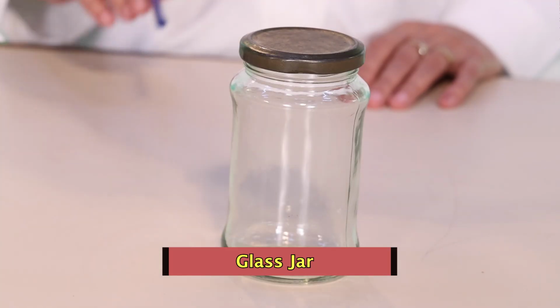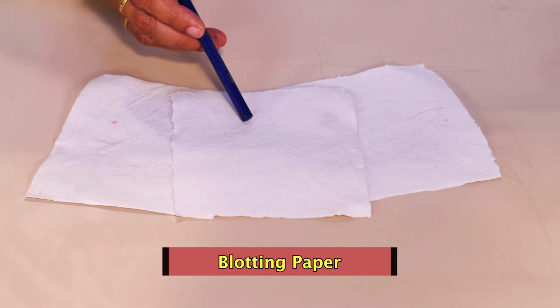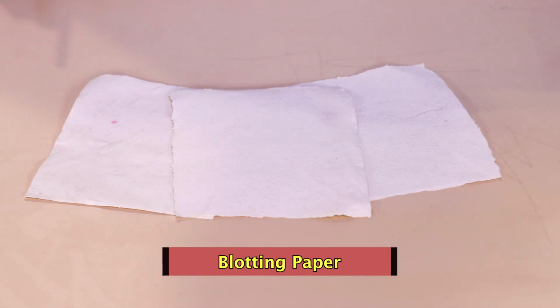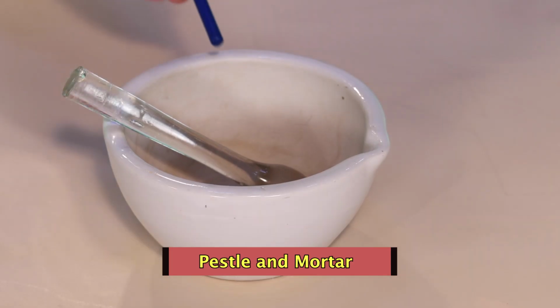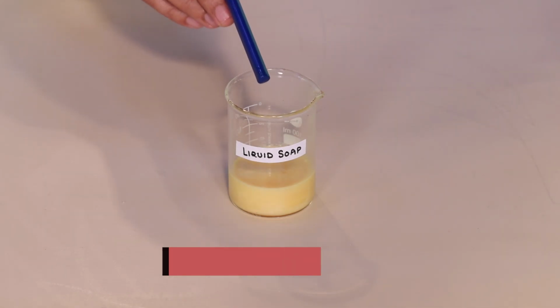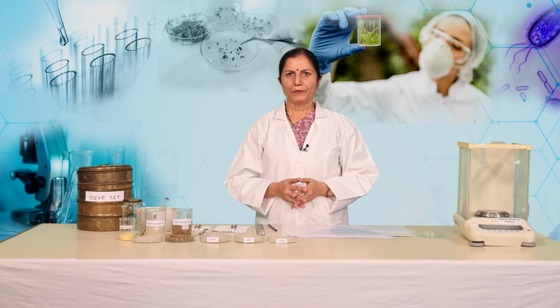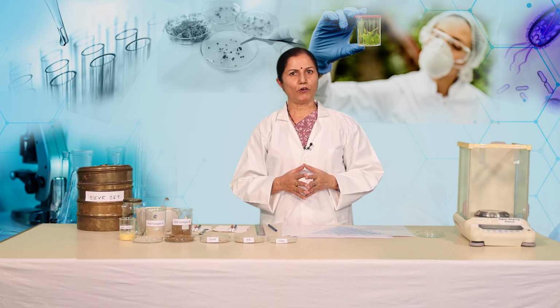To perform this experiment, we require an oven, dried soil samples, balance, mechanical sieve set, glass jar or wide mouth bottle, scale, blotting paper or newspaper, pestle and mortar, borax or liquid detergent powder. Dear learners, two methods are explained here. Any of these two may be followed.